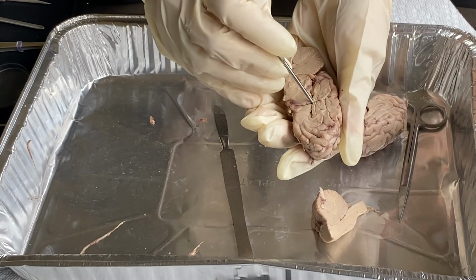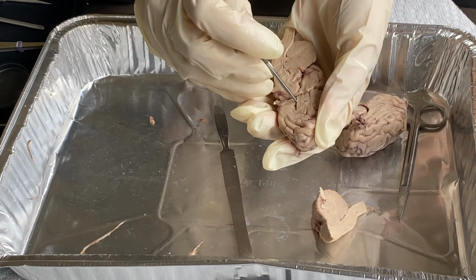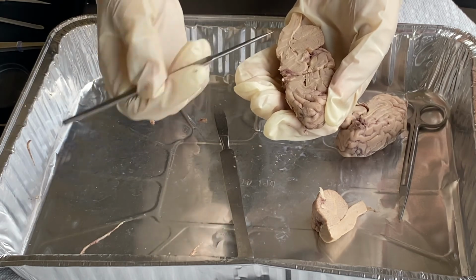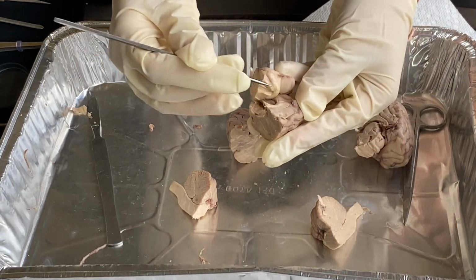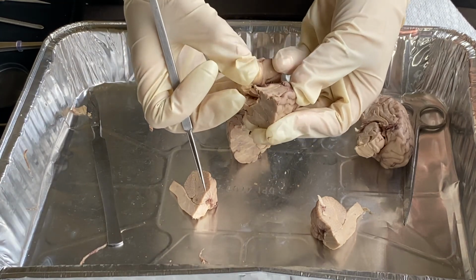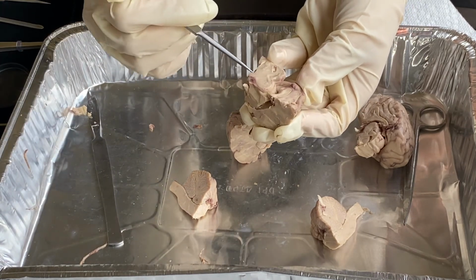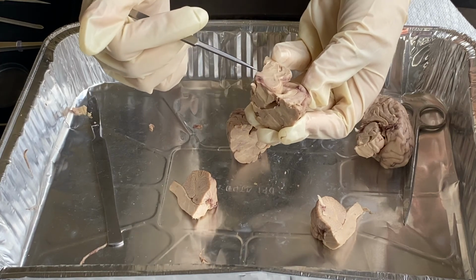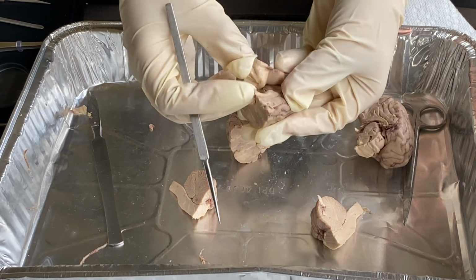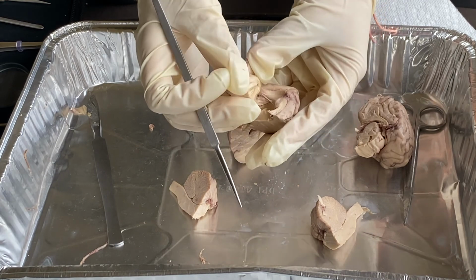So this is the lateral ventricle in here, and in order to find the hippocampus, I'm going to have to dissect everything dorsal to the floor of the lateral ventricle. So I believe this is the hippocampus because it was described as the inner folding of the cerebral cortex that's located right above the hypothalamus, and this was the hypothalamus. The thalamus. Hypothalamus was under here. The thalamus, and so I believe that this would be the hippocampus, and it functions in memory basically.